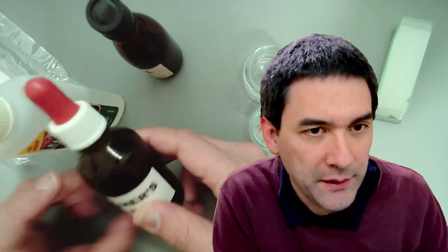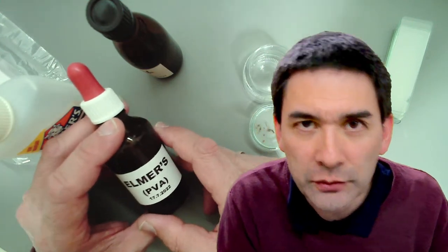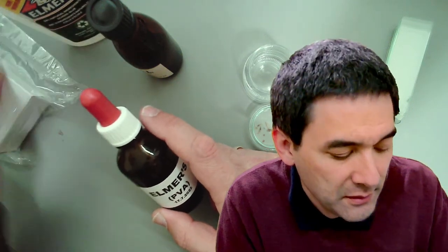Okay, if you don't know which mounting medium to use, and you just want to experiment around a little bit, or if you want to use a safe mounting medium because you want to do something with children, for example in a school, I can recommend this because it's simple to use, readily available, cheap, safe, and yeah. However, not all mounting media are the best for every specimen. You always have to make sure that the mounting medium matches the specimen.